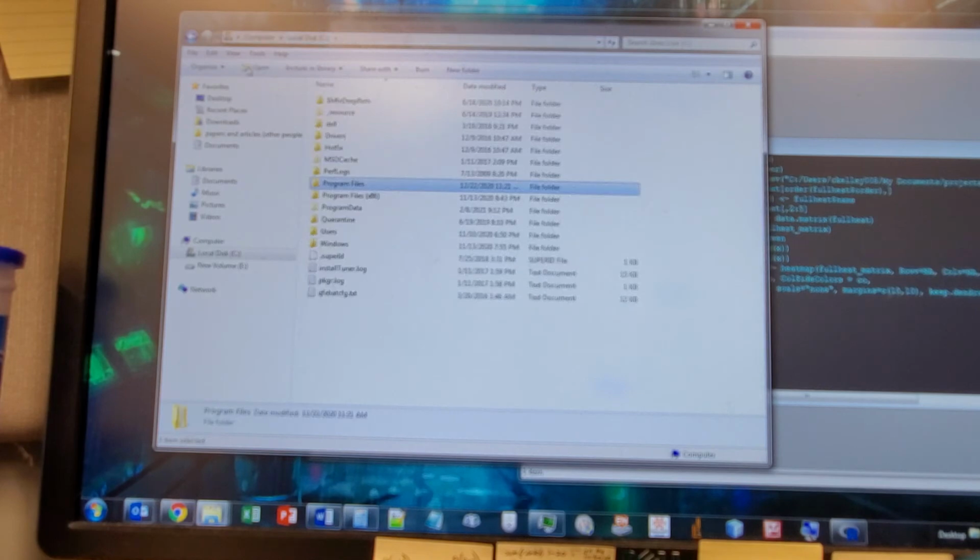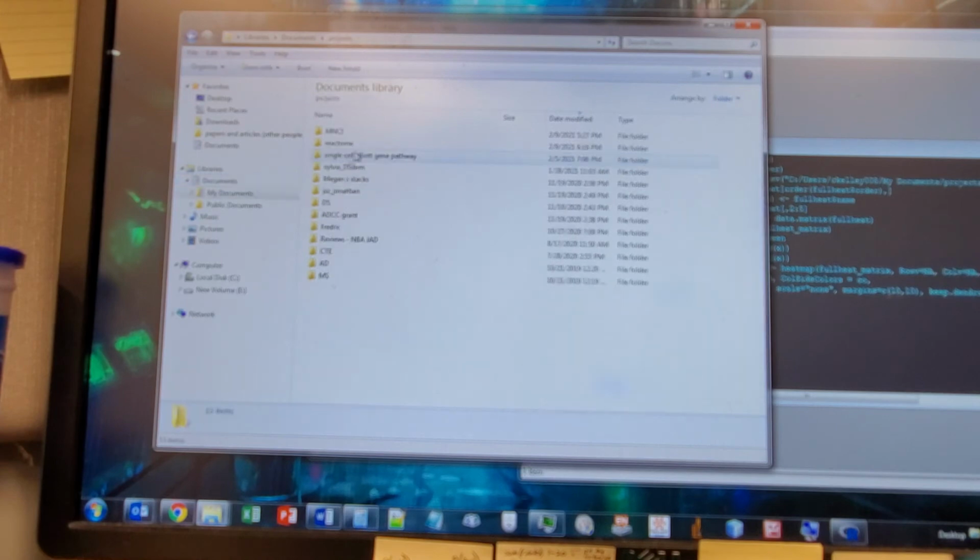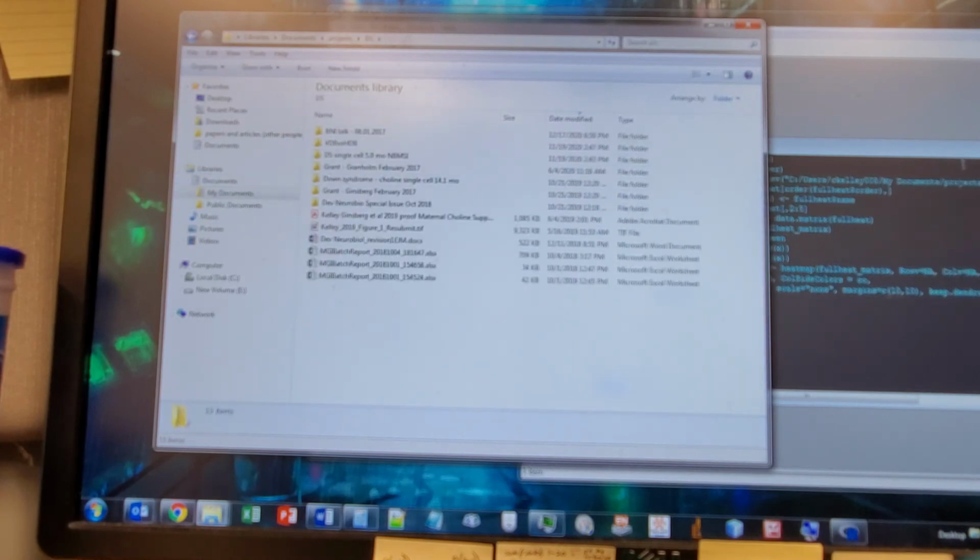So you can stop watching this or watch me troubleshoot. My documents, let me follow this. My documents, projects, developmental neuro, Down syndrome. Ah, that's the problem, it's the wrong path.